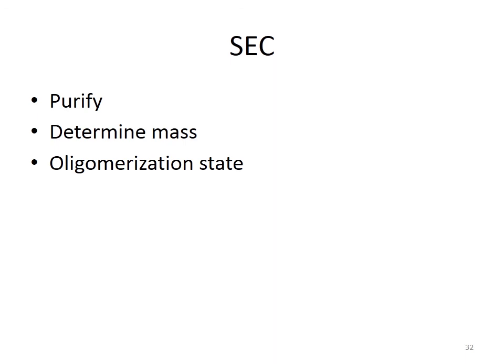If the elution pattern of the protein remains the same, that means the protein is not dissociated into any constituent components. So the protein is made up of only one subunit. However, if we see several different peaks of the protein eluted at different molecular masses, that means the protein of interest was made up of several subunits which have dissociated from one another, and now each subunit is going to be eluted corresponding to its own molecular mass.